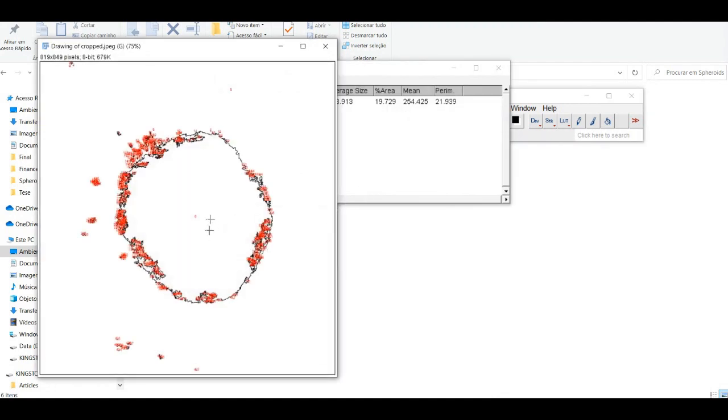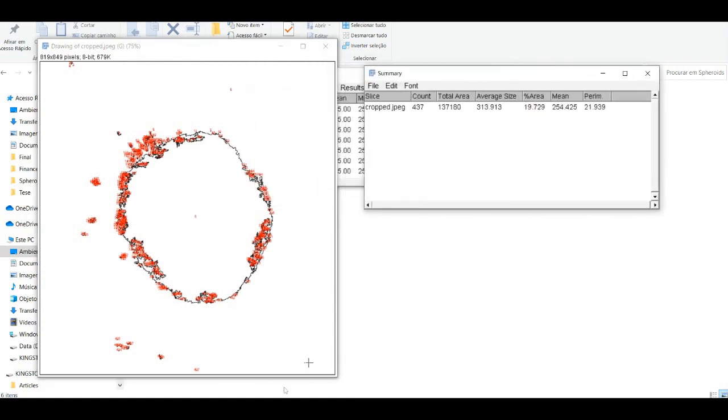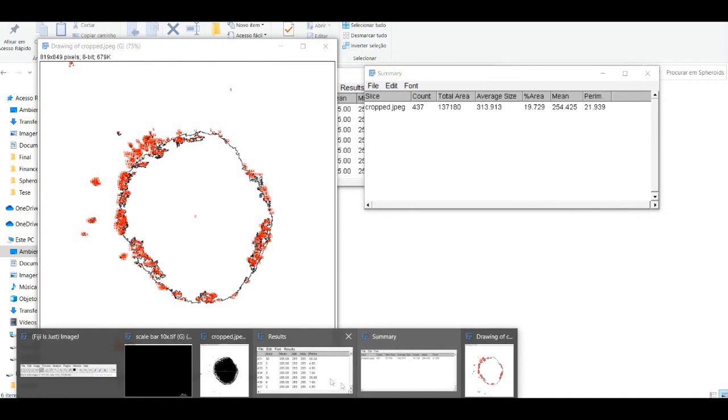In this case, A. You can then copy/paste into your Excel spreadsheet and repeat the process to all the images of the different treatments that you have.